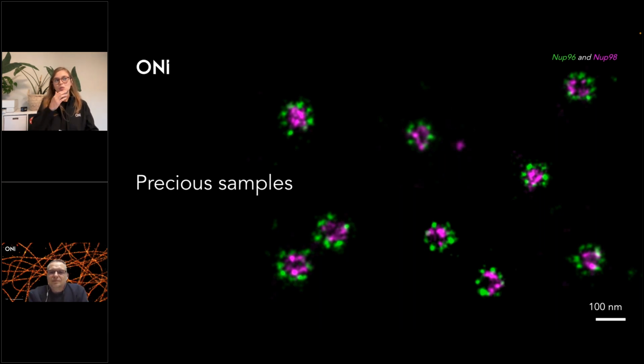I remember there was also a paper where they demonstrated they can detect low abundance protein in dSTORM, but it was not enough to detect in flow cytometry. Yeah, this is possible because the number of localizations we are collecting depends on the fluorophore you are using. Ideally, you will use a fluorophore like Alexa 647, where usually all the imaging buffers are optimized. In this case, you can detect a low abundance of the protein by using STORM or dSTORM.